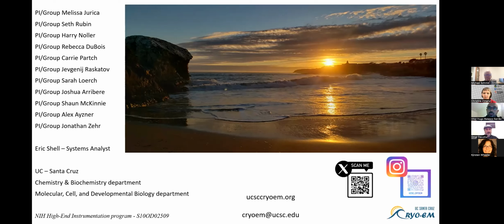Knowing that, we discussed collecting at a lower dose with this better setup, and collecting way more. So we increased the number of movies and the number of particles with a very, very low dose. We kept exactly the same magnification and the same other optics setup, but the only thing that we changed was the dose and how many movies we collected.